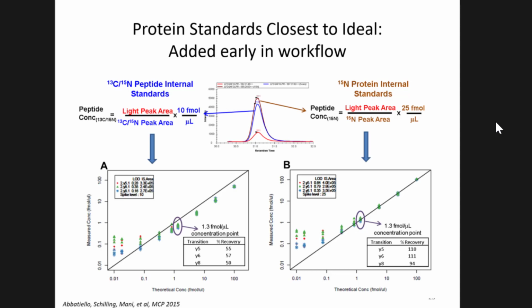If we take one set of experiments that were run where we monitored light, heavy, N15, and we plot normalizing to just that synthetic peptide standard, this is the response we see. Again, this is plotted on a log scale so we can see how things work out down at the bottom end. You can see the signal begins plateauing with greater variability, and that's normal.